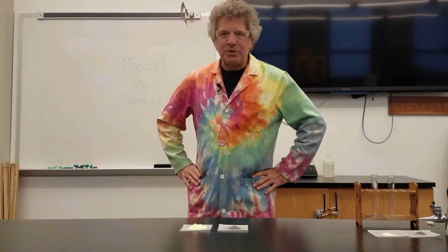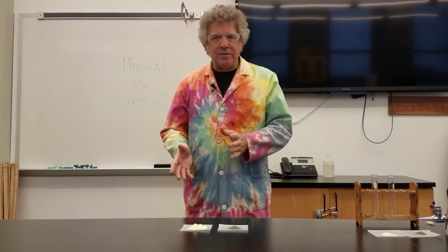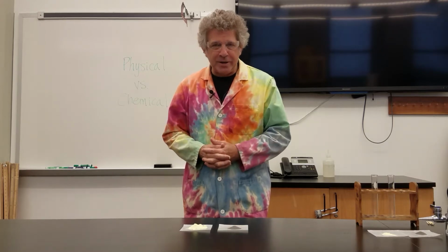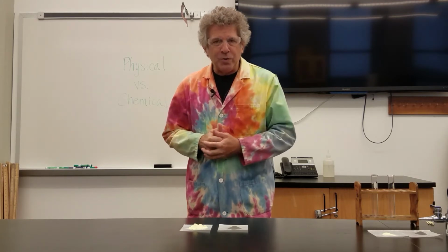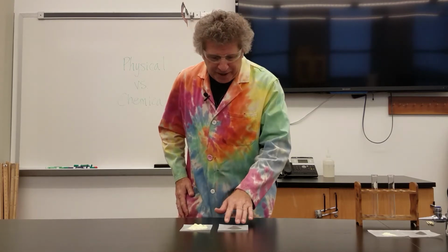Hello everybody. Today we are going to look at a demonstration of types of matter, and how we can combine these types of matter to look at different classifications of matter, all based off of the properties of the matter that we have. We're going to be working with two elements, and I have samples of those two elements here on the lab table. Here I have iron.